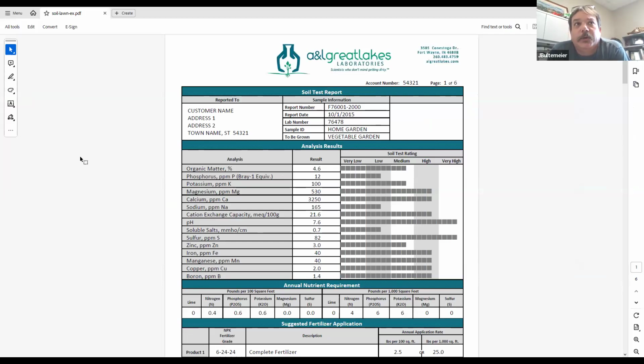When you send in a soil sample, we request that you send in a submission form. That submission form is basically our instruction sheet. What do you want us to do? What test do you want us to perform? And who is it for? And so the submission form will drive which one of these tests you get.